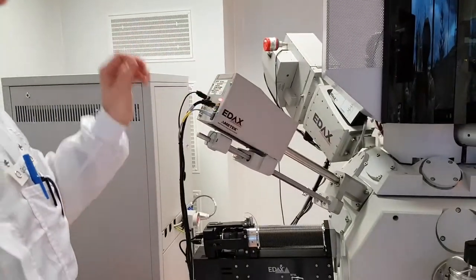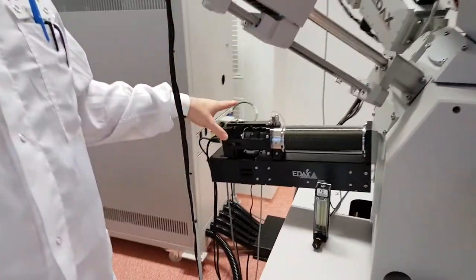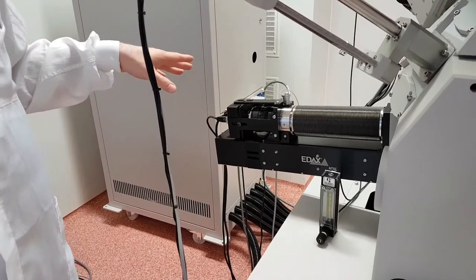This is the EDS detector. This one is so-called EBSD, so electron backscatter diffraction detector.